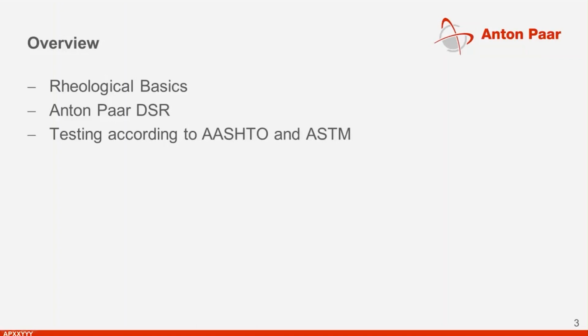Prior to this, I would like to explain really quick some basics of rheology, as well as the devices Anton Paar is offering for all kinds of rheological tests on asphalt binders. If anybody wants to learn more about the basics of rotational and oscillatory rheological measurements or methods, I can strongly recommend the webinar of my colleagues, Mr. Thomas Metzger and Mr. Christopher Giel on the 9th and the 10th of June. So today we will only learn the basics we need for the asphalt binder test methods.